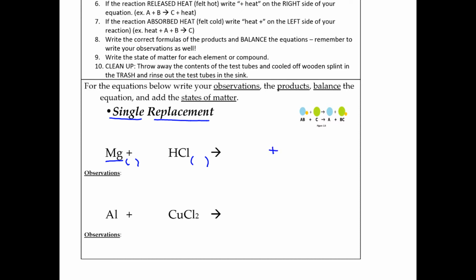One product that you formed you knew was a gas because you saw bubbles, and of course that's going to be in your observations. When you did your splint test on this, you should have found that this did a pop. So when you have a pop, you can tell that that must have been hydrogen gas, and hydrogen, remember, is written as H2 because it's diatomic. Even just looking at these two, HCl and Mg, if you had to make a gas, it makes sense that hydrogen would be the gas because you could see it in here.